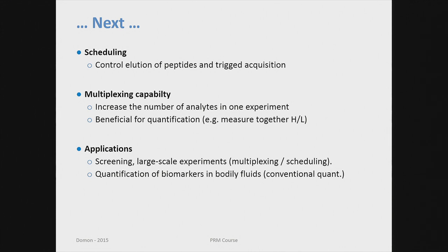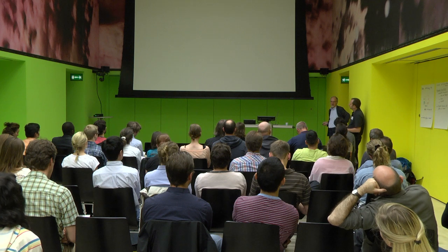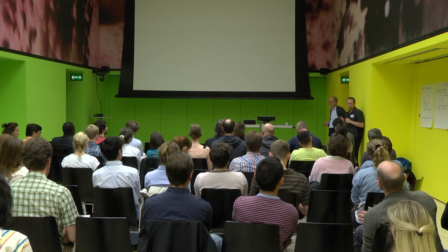But it also then needs some clever on-the-fly decisions, and that's why I use the MS/MS spectra. So that's why I was already insisting a little bit on not only the traces, but actually the ion intensities or the ion ratio being quite important. And I guess I can take questions now, if there are some.